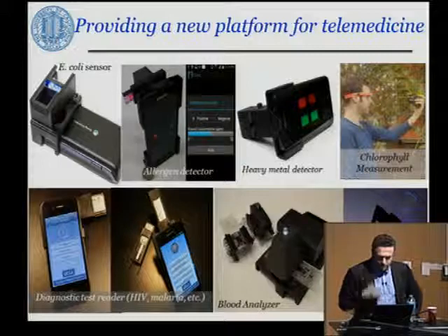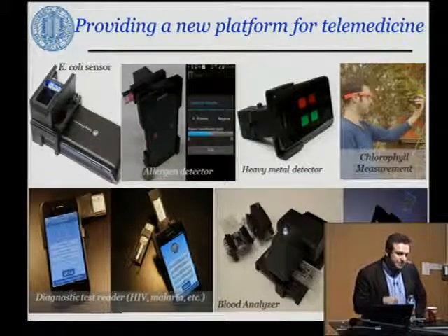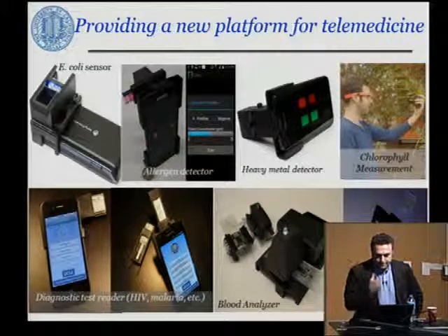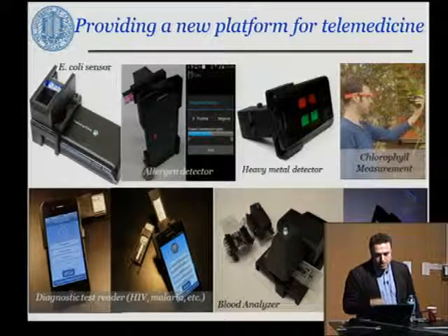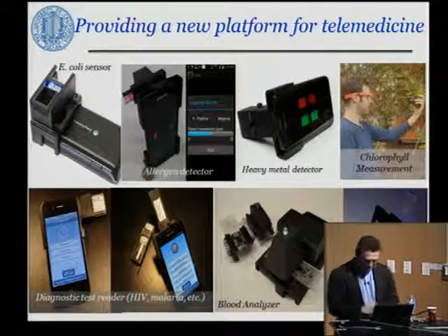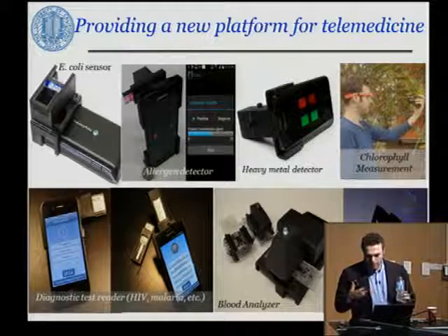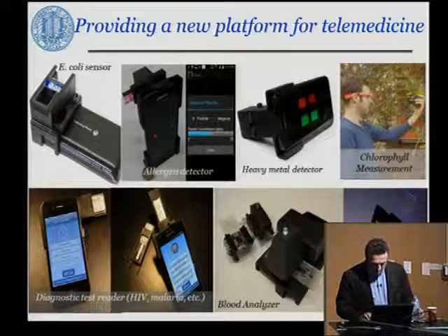And recently, we've converted that into actually a chlorophyll meter in a non-destructive way through transmission of the light through the leaf. You can actually do a similar colorimetric analysis after some calibration to infer in a quantified manner the content of chlorophyll, nicely matching to a handheld or other types of chlorophyll meters available, of course, much more mobile.